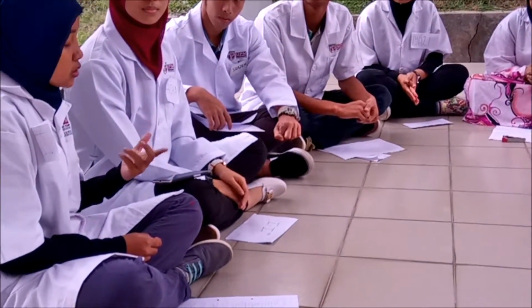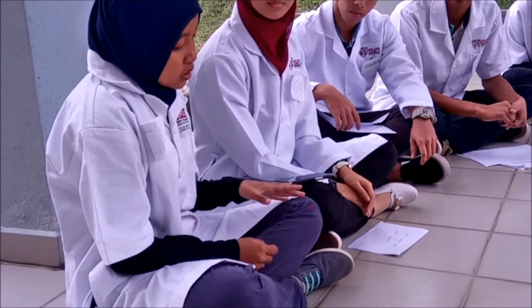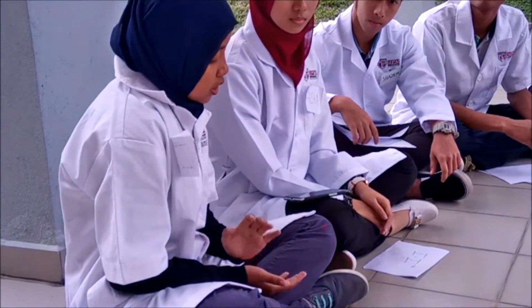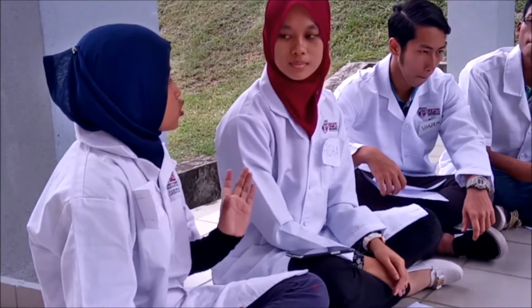Spectrophotometry is a measurement of how much a chemical substance absorbs or transmits, making each compound different from the other based on its absorbance. We can roughly see how spectrophotometry plays its fingerprint role in bioassays. So Aisha, could you tell us a little more about the device itself, the spectrophotometer?